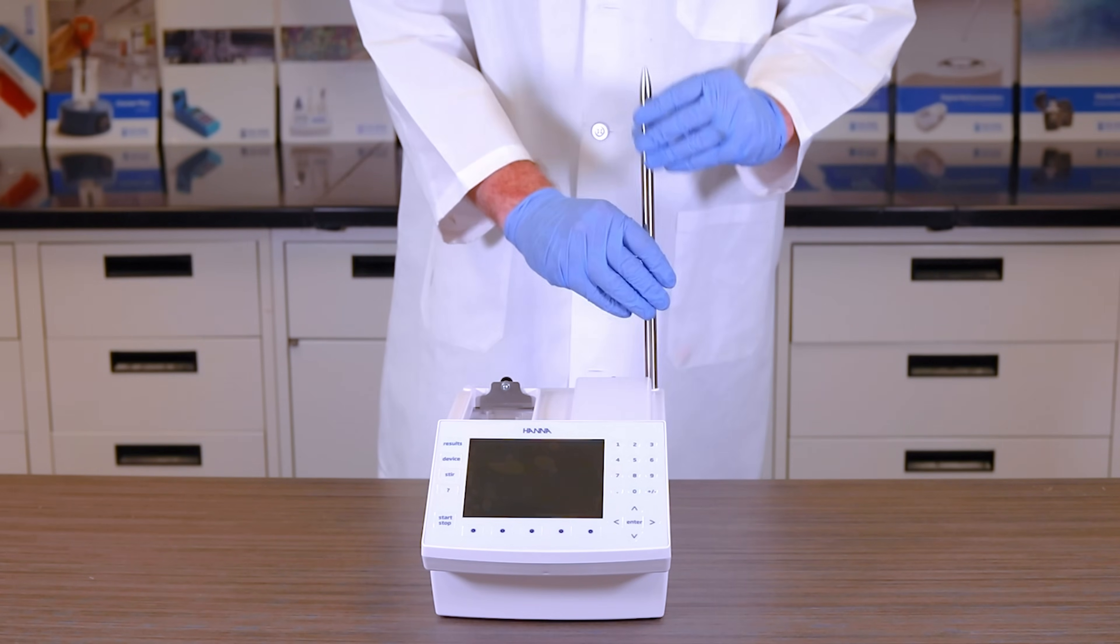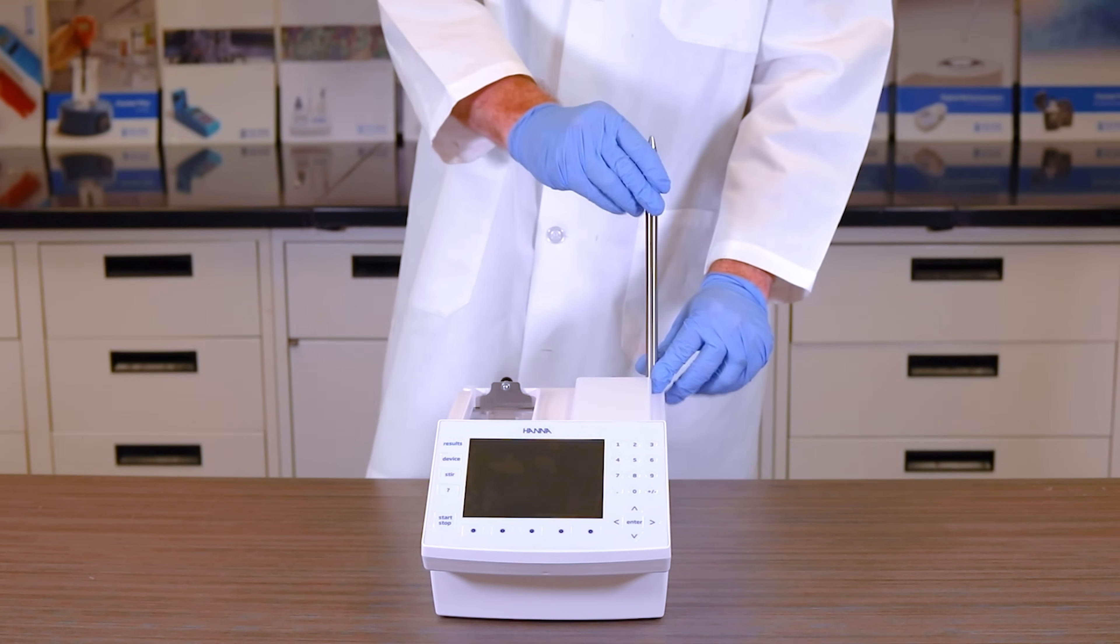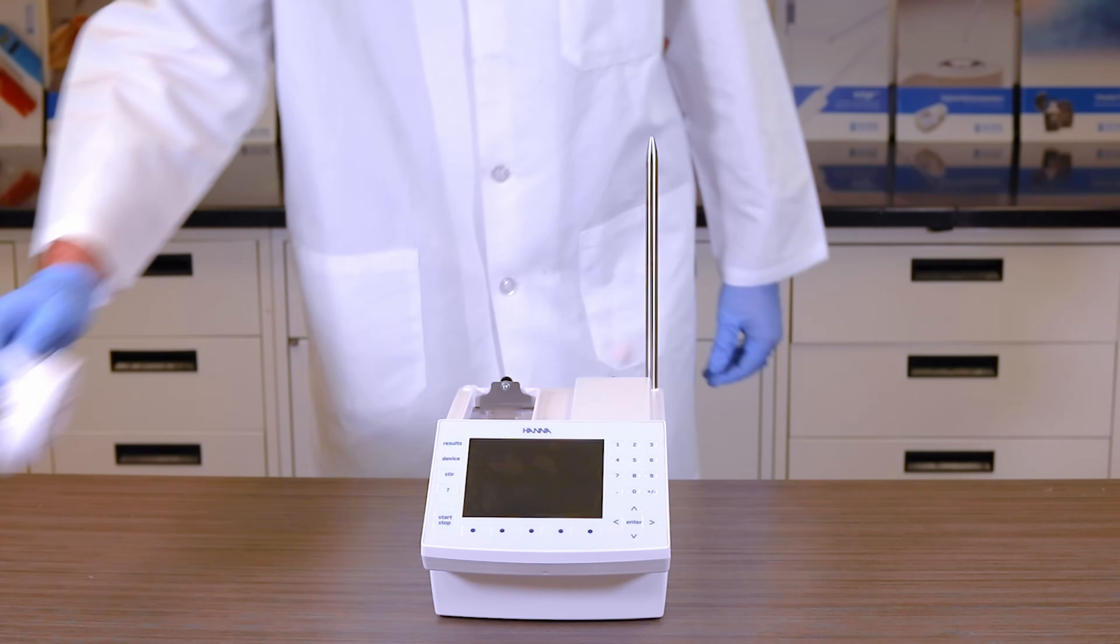Next, find your steel assembly rod and screw into place on either the left or right assembly well. Hanna Instruments recommends using the rightmost well.